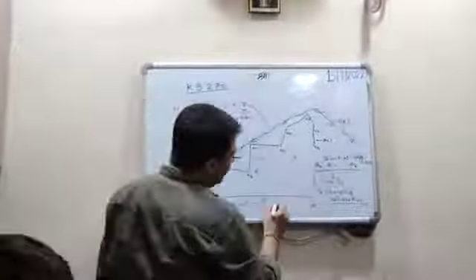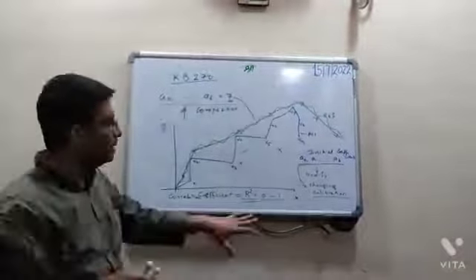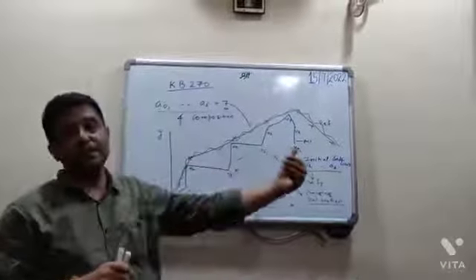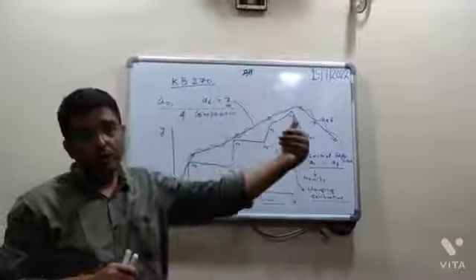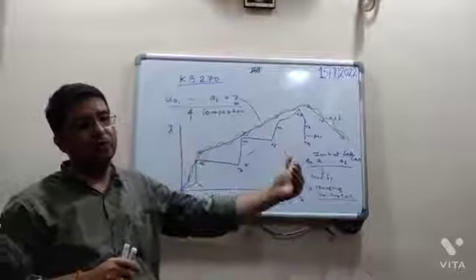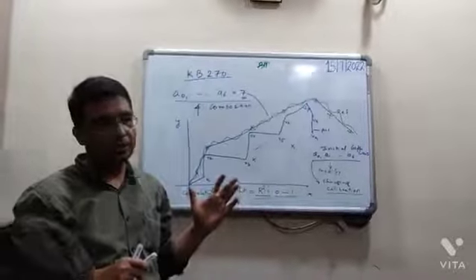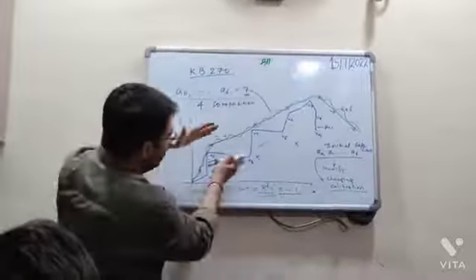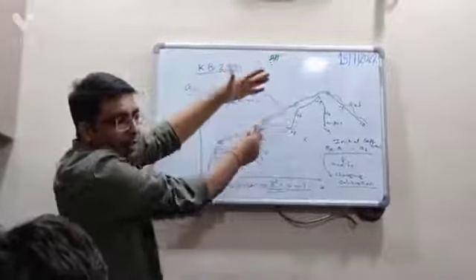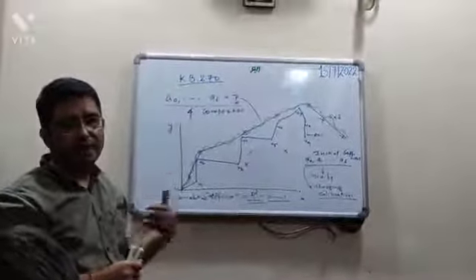Now it has a value between 0 to 1, right? 0 means not aligned. 1 means it is 100% matching. So the nearer to 1, the better the calibration. Clear? So if this blue curve exactly matches with the green one, that means it's the best calibration you did.